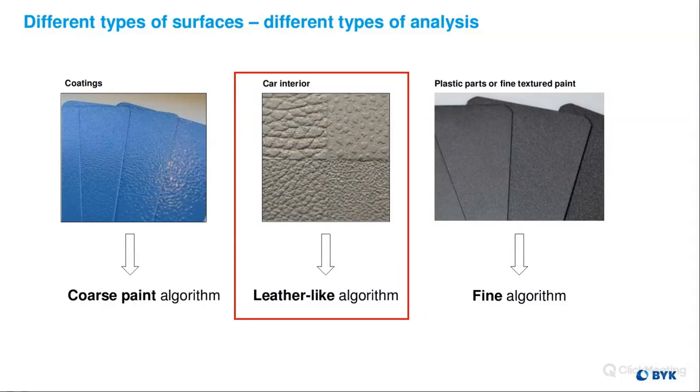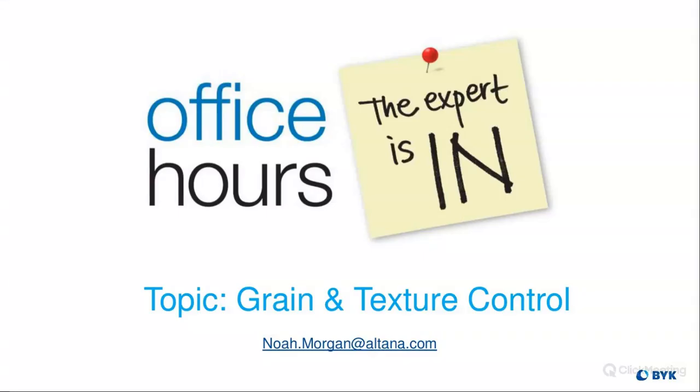He wrote a follow up here too. They have multiple spectro2 profilers and have some measurements on the instrument using a linen cloth pattern. Yeah, it's very interesting. I'd like to, outside of this, maybe talk on the side and look at your different material one-on-one. That could be pretty useful.